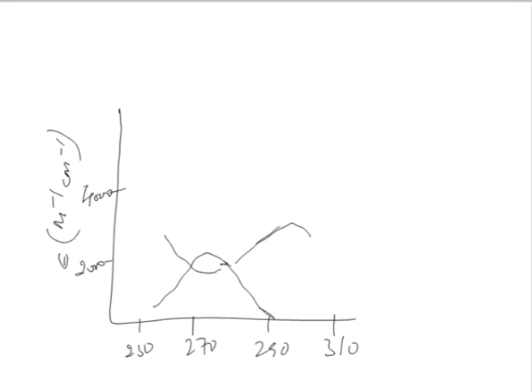You can see that this is the absorption spectra of tyrosine. This is at pH 6 and this is at pH 13. Here the absorption maxima is around 274 nanometers, and here the lambda max is around 295 nanometers, somewhere around that.